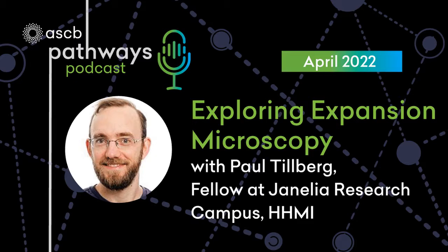I love that image. You can see little virions in there. You can see the multivesicular body membrane. You can see it fusing with the plasma membrane. And what's the scale? What's the length scale of something like that? Yeah, I think the virions are, what are they, like 50-ish nanometers? And that multivesicular body must be on the hundreds of nanometers to micron scale.